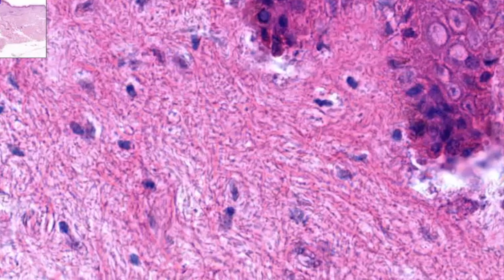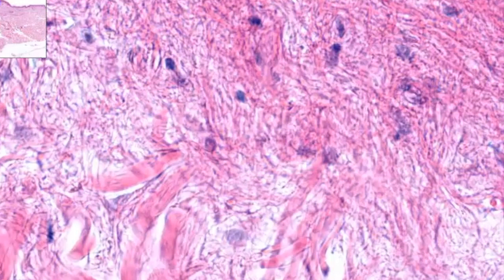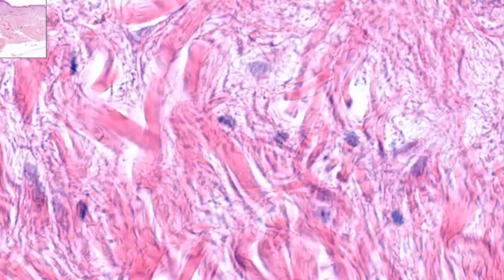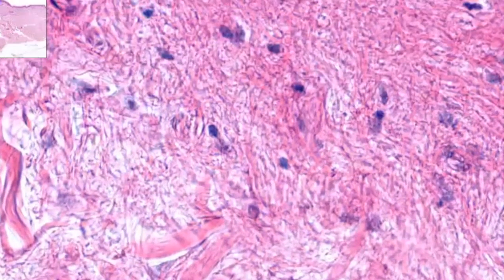I just want to make sure I'm getting this right. Is the pink strips, is that the actual collagen? Yeah. That's the actual collagen. You can't see the ground substance, remember. So the only things you can see are the cell nuclei and these strands, right? They become more obvious in the dense irregular connective tissue because these are big bundles of collagen fibers, whereas these are like single stranded. The way I put it in the video is think of these as kind of like fine hair, spread out, whereas these are like a ponytail, basically. That's the difference between them.